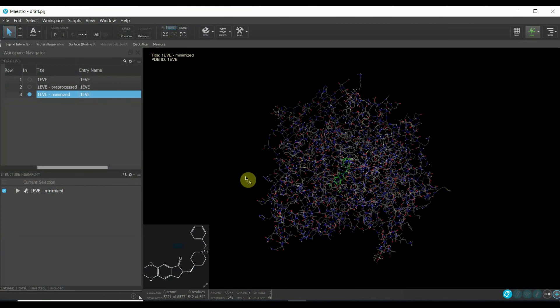So this was how to use the ligand interaction diagram. I hope it was useful for you.